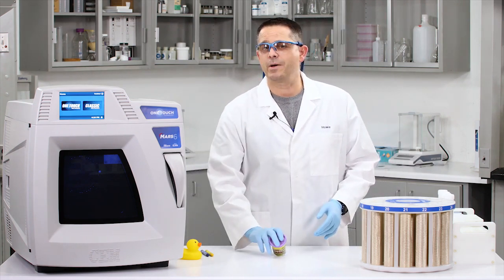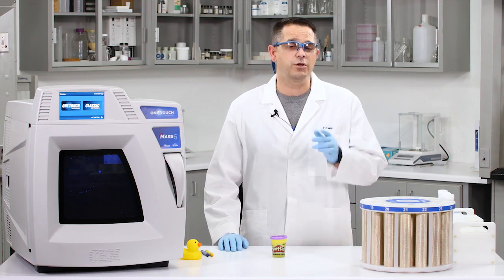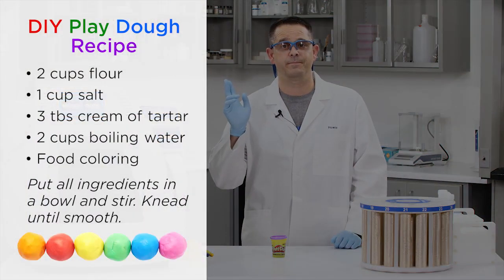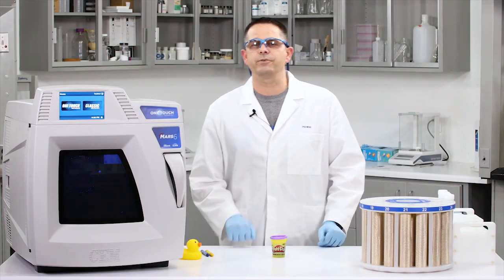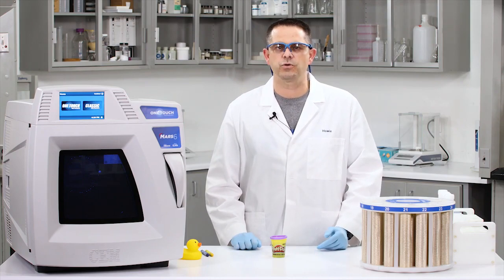Play-Doh is manufactured by Hasbro and is made from a mixture of mostly flour, salt, and water with a little binder and surfactant thrown in for good measure. For the do-it-yourself folks out there, you can make your very own Play-Doh at home with this recipe. Since none of these ingredients are very difficult to digest, we'll use the Mars Express family of vessels to do this work. Also, Play-Doh can be classified as a children's toy.